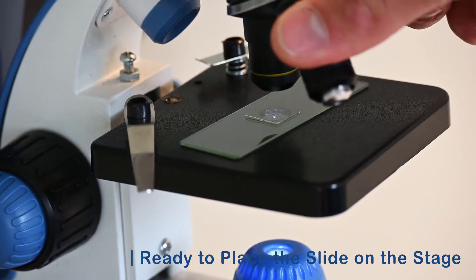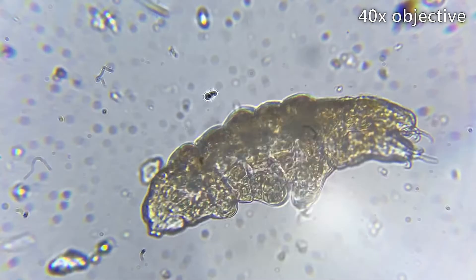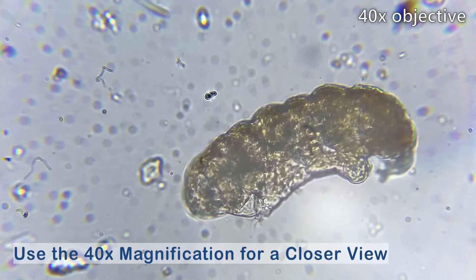Now we can use the larger magnifications to get a really close look.